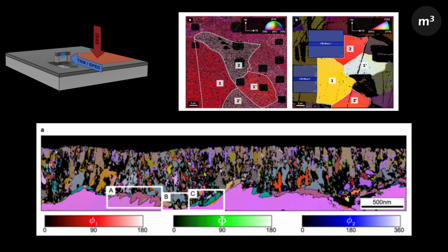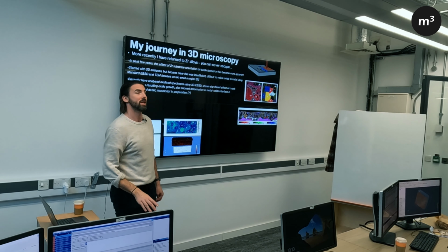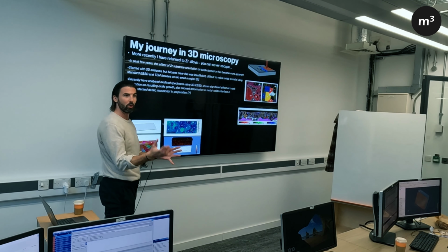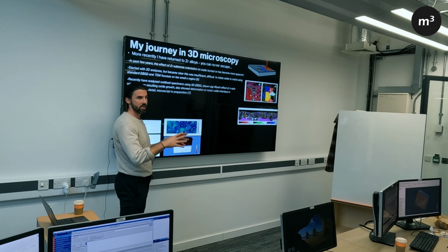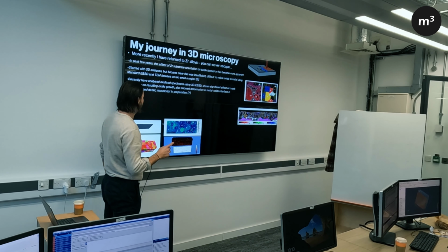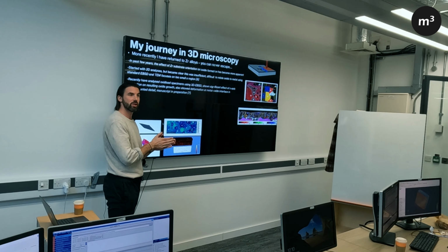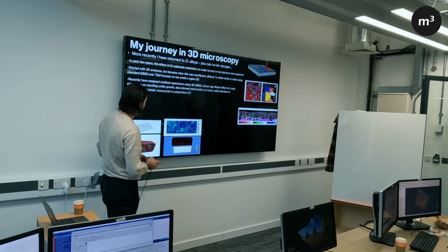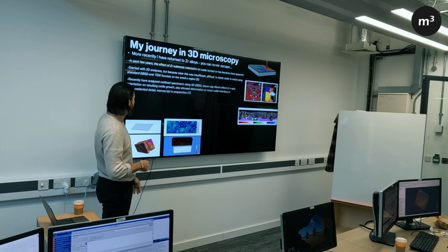Recently, we've extended this to 3D EBSD. And basically we get a lot of benefits from looking at this in 3D. Number one, we get a lot more grains. Number two, we can look at the effect of grain boundaries in the statistical volume. And the third very crucial thing is with the 3D, because we're not inducing any deformation as you would with mechanical polishing, we can now look at the subsurface deformation caused by the oxide, which has never been done before.